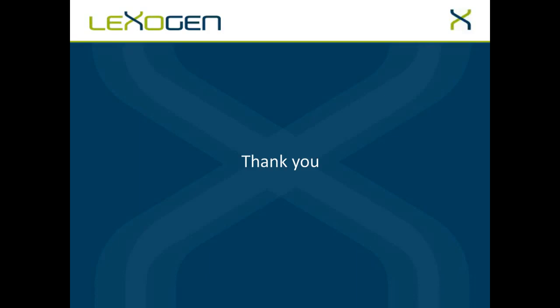Is there a way to get SERV Suite outside of Galaxy? So the nice thing is that all those tools that I showed are based on command line tools and freely available software. So yes, you could just contact us and we would help you to transfer that also outside of Galaxy.